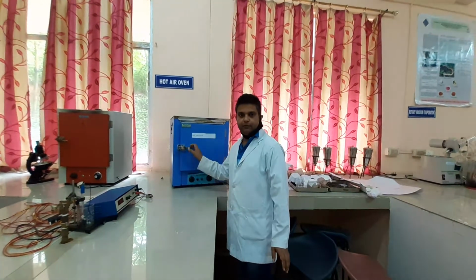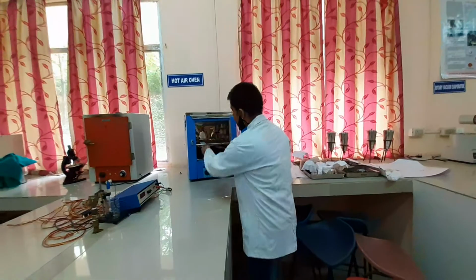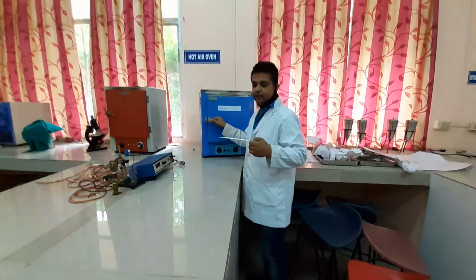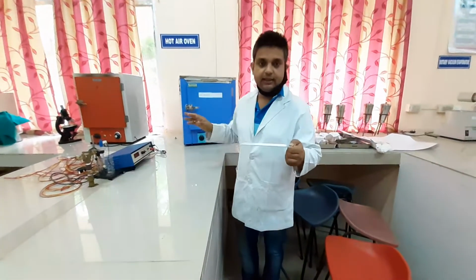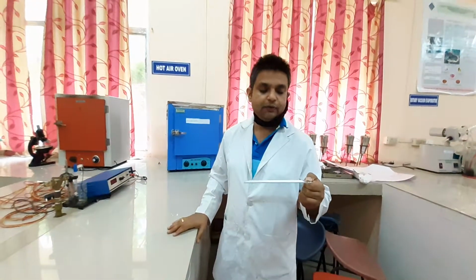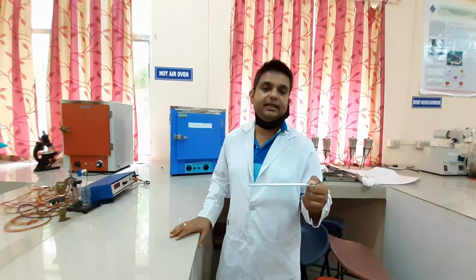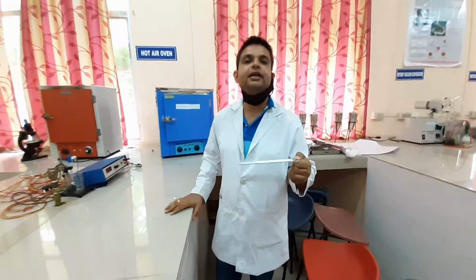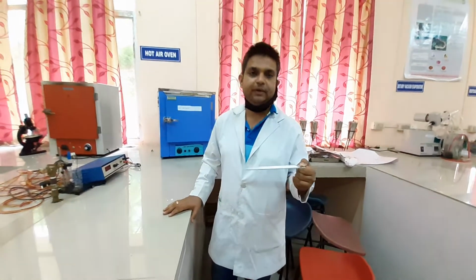So we have already waited for some time, and let us see what is the condition of the plate. So this is a dried plate. You can see here the dried plate. Now on this dried plate we are going to spray ninhydrin as spraying reagent, because ninhydrin is used as a staining agent for most of the amino acids.